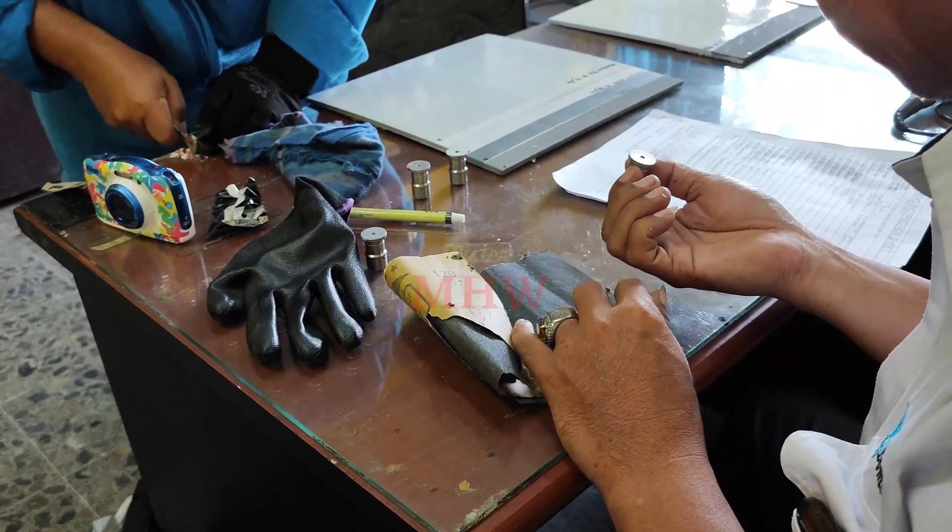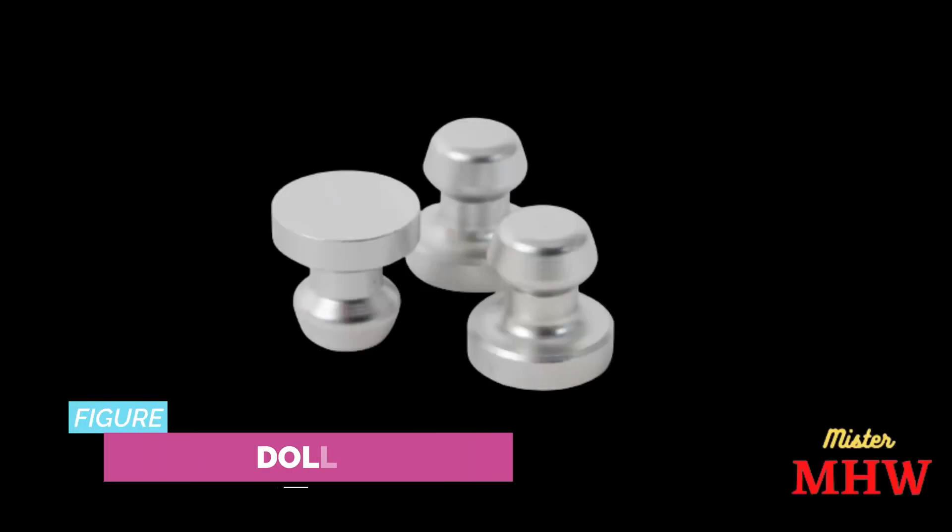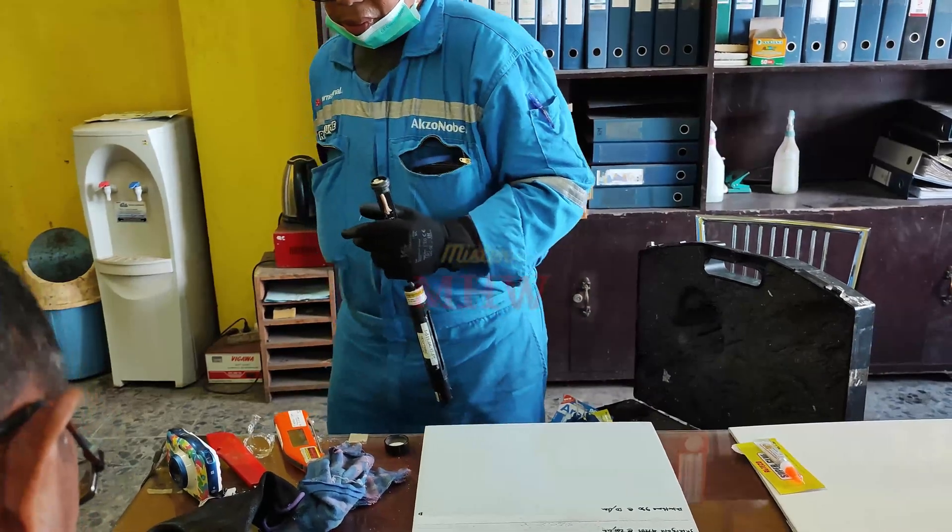At the beginning of the test preparation, make sure the surface of the dolly is clean, free from any adhesive material from the previous test that stuck to the surface of the dolly.